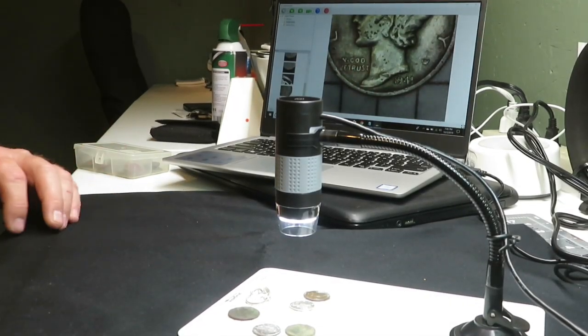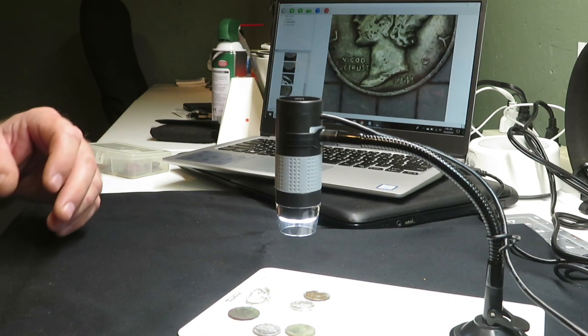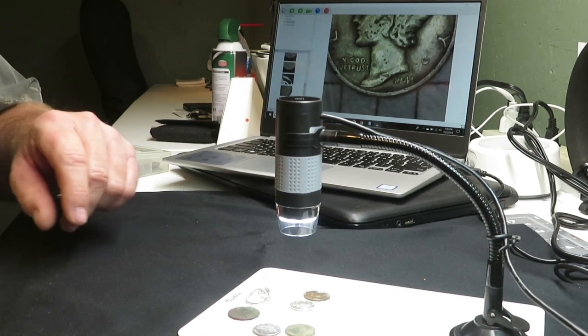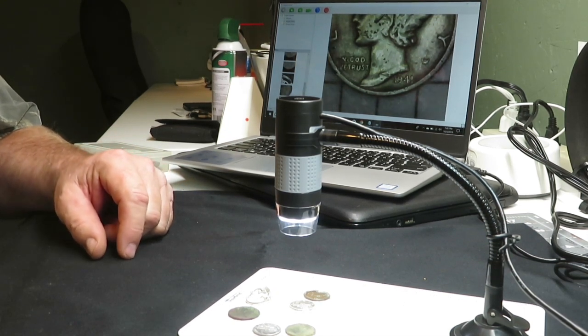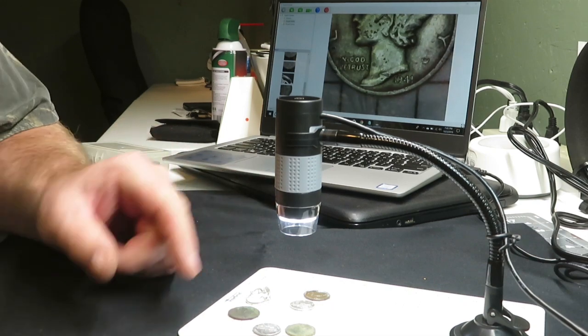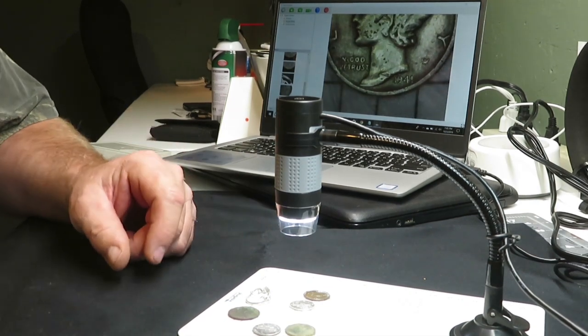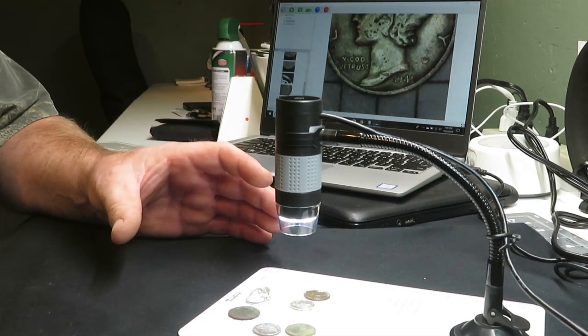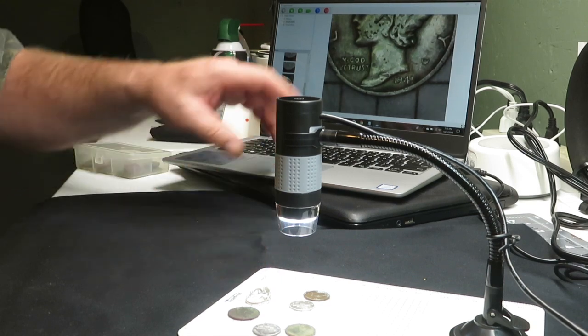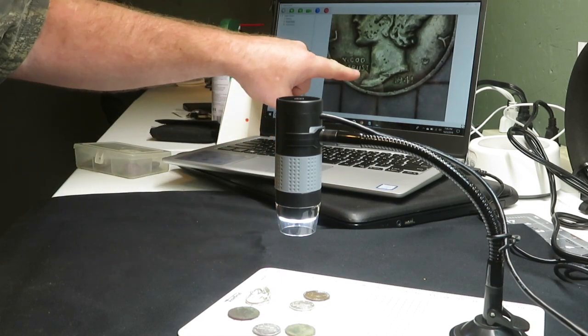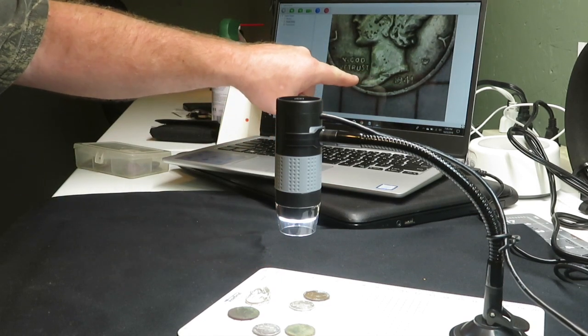All right, let's get up and personal with this little microscope. I think you guys are gonna really enjoy this thing. As you can see, it's sitting right here in front of me. It's not very big, doesn't take up very much room on your table.